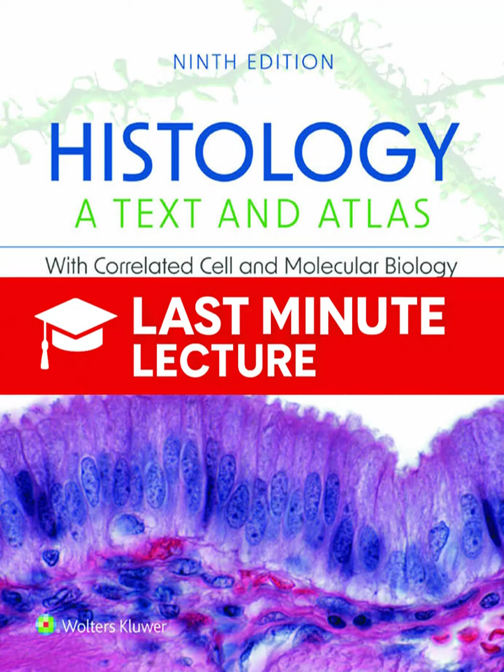A laser beam is reflected off the top of the cantilever onto a photodiode detector. When the tip hits a bump, the cantilever deflects, and the photodiode precisely measures that tiny deflection. A computer records the adjustment needed to maintain a constant force and translates that into a high-resolution topographic image. And the resolution is incredible. We're talking molecular and atomic resolution, down to 50 picometers. And the major biological advantage is that you can image specimens in their native state. You can look at living cells submerged in water.